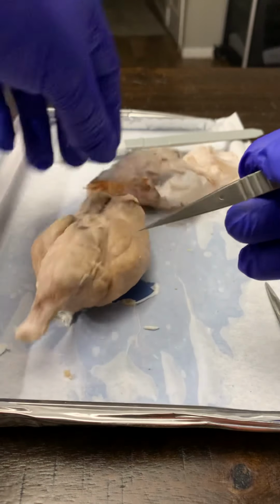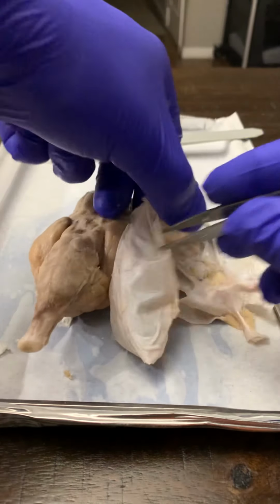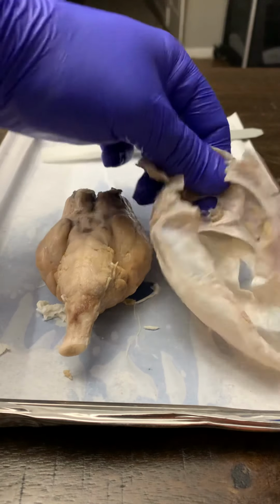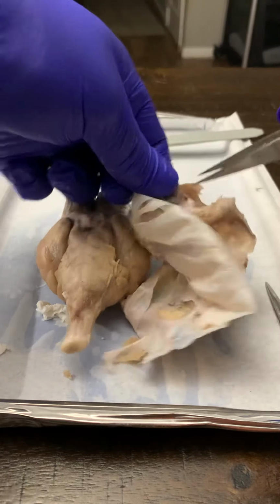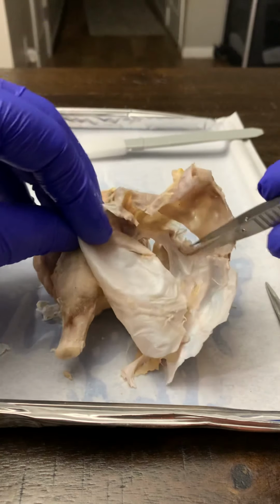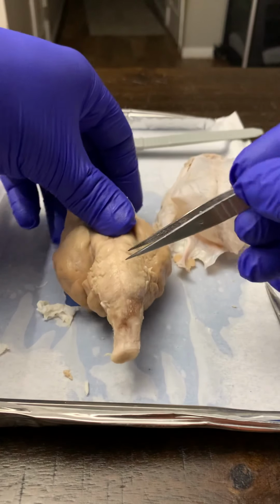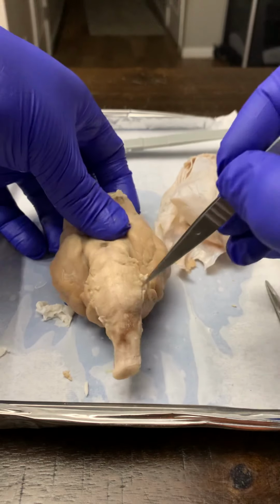Cranial nerve number 5, trigeminal. You can actually see from my dissection, it's going to be this thick nerve right here. It's going to be roughly in this area right here.